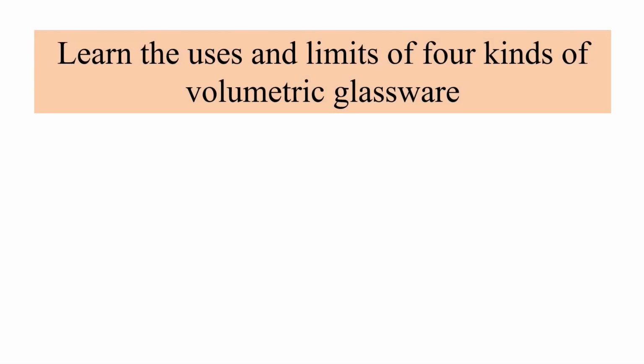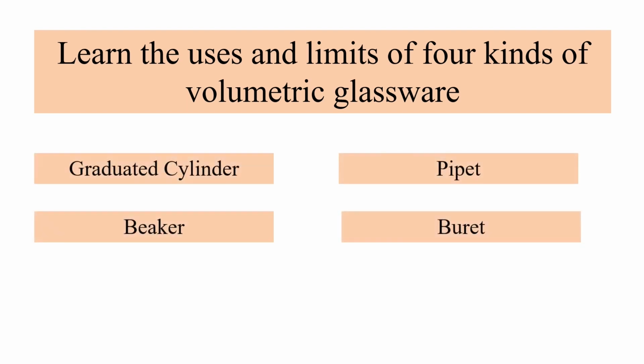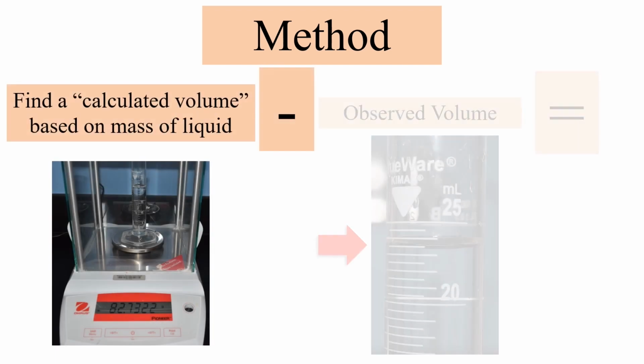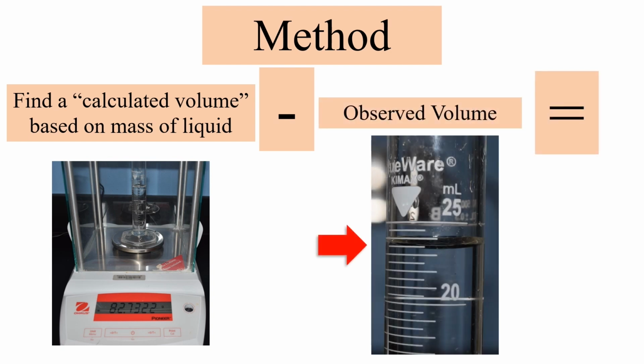Let's take a closer look at the experiment of comparing different glassware. We want to learn the uses and limits of four kinds of volumetric glassware: the graduated cylinder, beaker, pipet, and buret. The way we'll do this experiment is to find the calculated volume based on the mass of the liquid and subtract the observed volume. In other words, how precise is our observed reading compared to measurable data, the mass of the liquid?